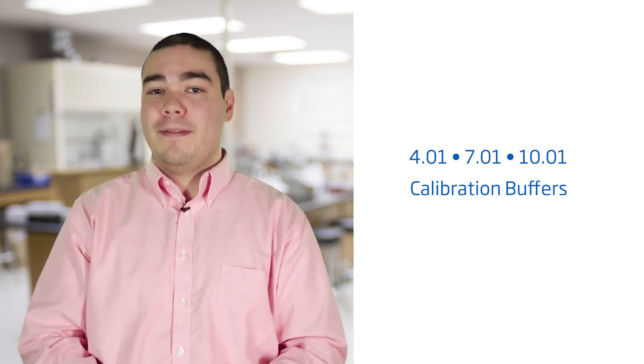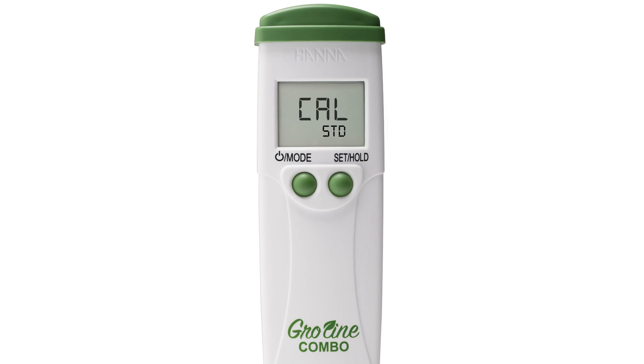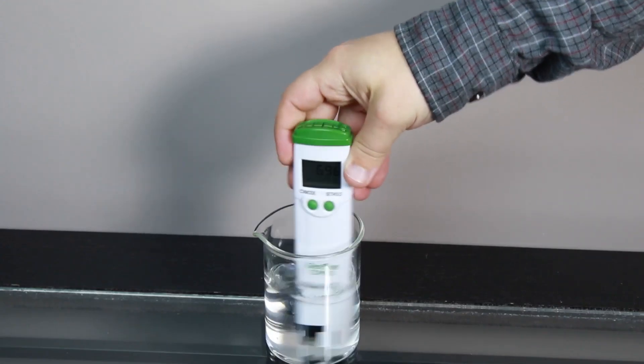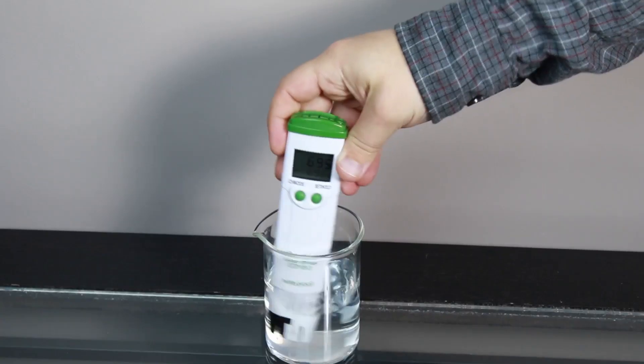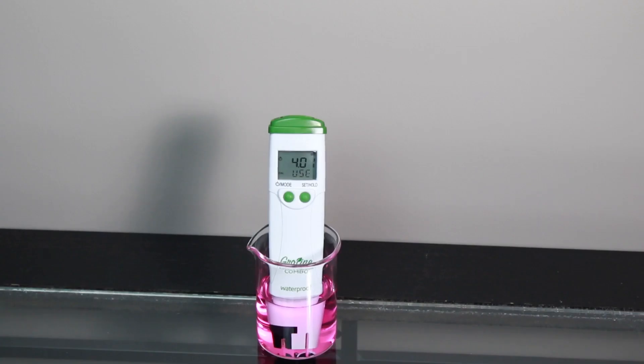Your tester also uses standard 4.01, 7.01, and 10.01 buffers. To calibrate to two points, first be sure you are in the CAL standard setting. Rinse in distilled or deionized water and place the tester in your Hanna calibration buffer and wait for a stable reading. The tester automatically recognizes which buffer you use first. Once stable, it will ask you for the next buffer. Rinse again in distilled or deionized water, place it in the next buffer, and once recognized, the tester will return to measurement mode.